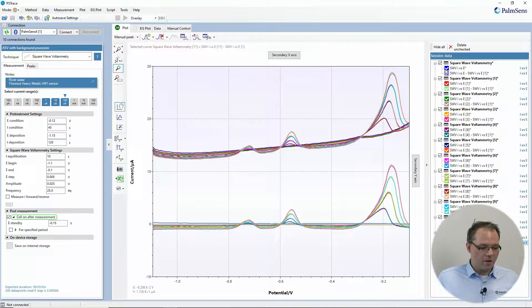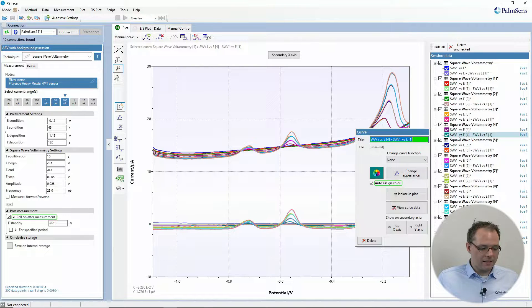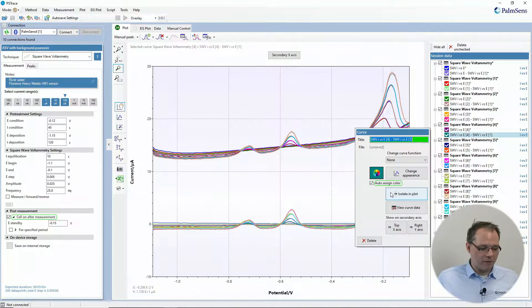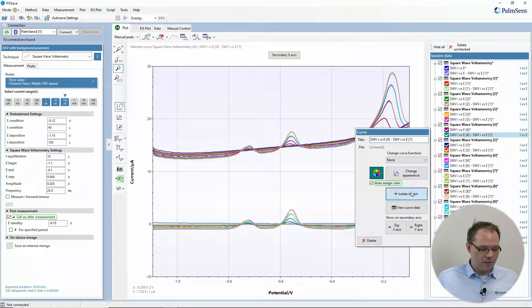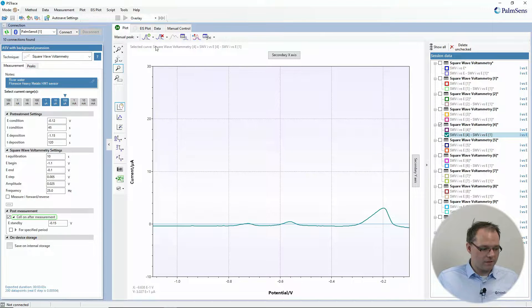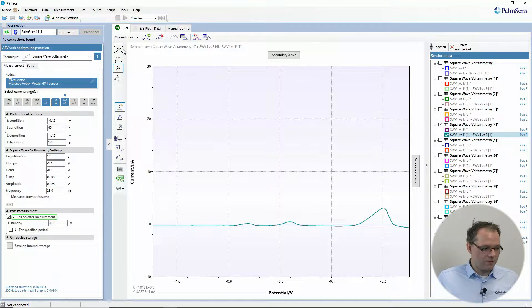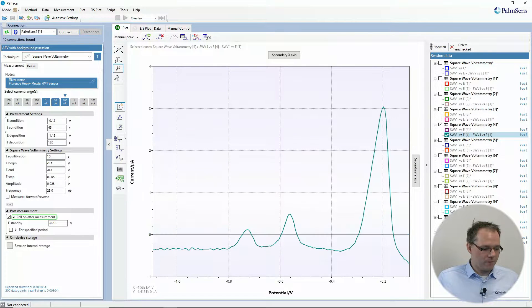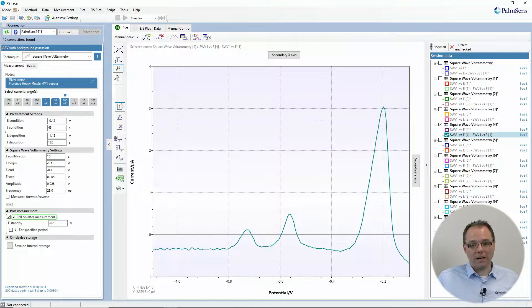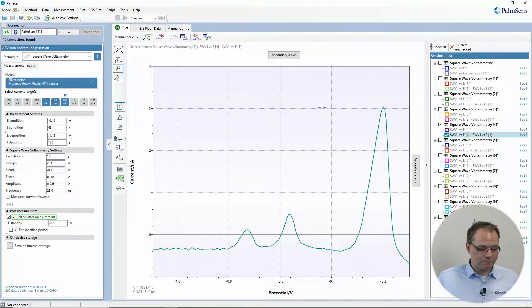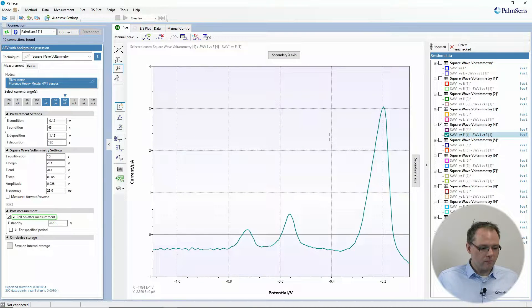So now I have nicely subtracted a background. So if I isolate this one and plot, now this one gives a more straight baseline than before.